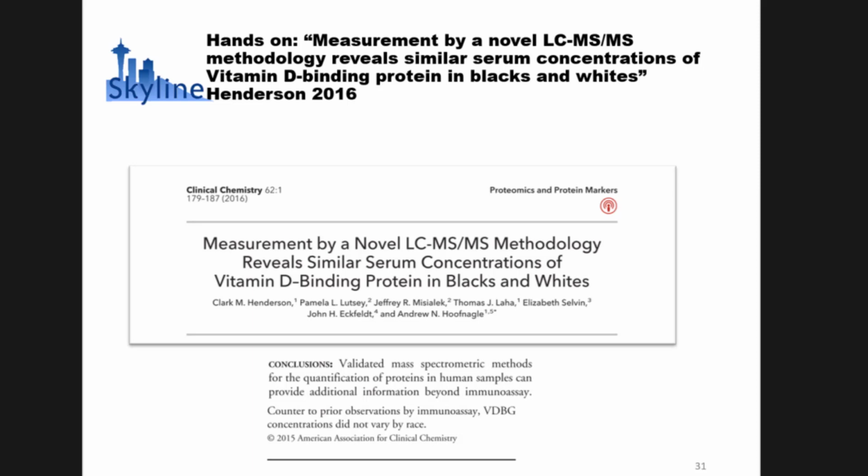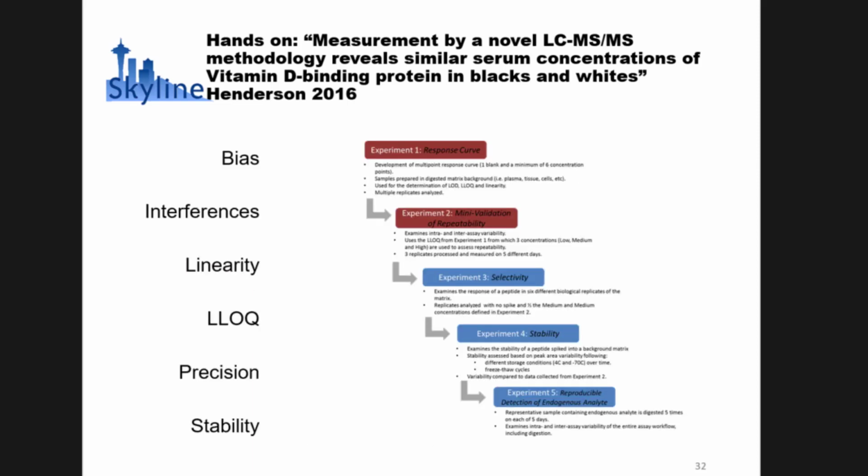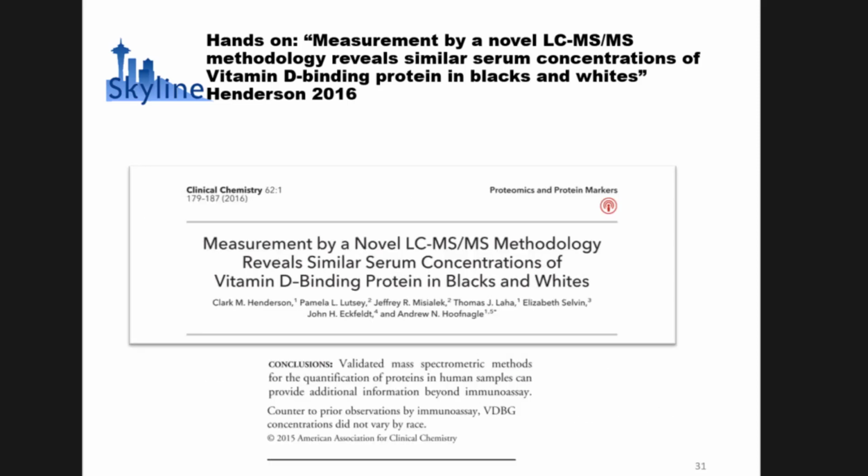Yeah, we're going to be talking a lot about system suitability tomorrow, like basically all day. We're talking about system suitability and methods QC. I don't start running any samples until system suitability passes. All right. Any suggestions on internal standards? Oh, Sue's got a whole section on standards, so we're going to talk lots about those. Just for fun, I don't use any. So we'll also talk about that later, too.